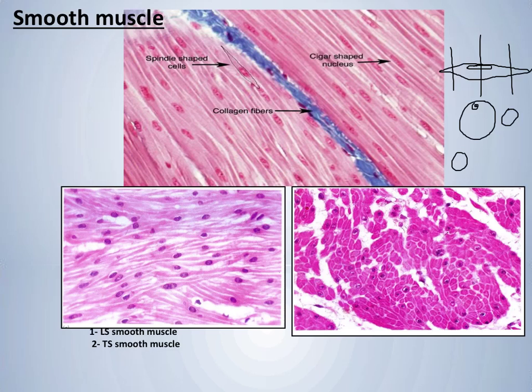So if you look at this picture, some of the sections have a nucleus inside, so it is most probably the central portion, and we have other portions which are devoid of the nucleus, and these of course are the peripheral parts that do not contain the nucleus. And we have this white area, which is very fine connective tissue in between.